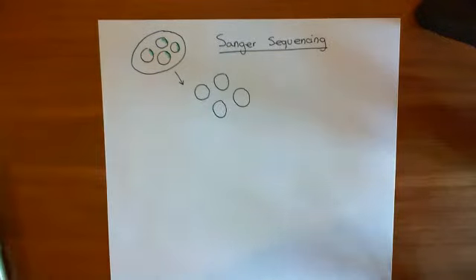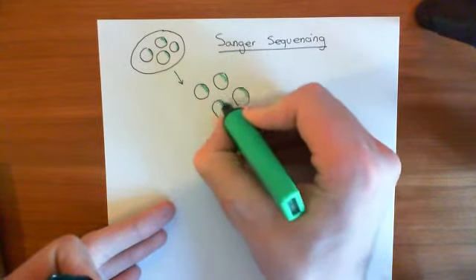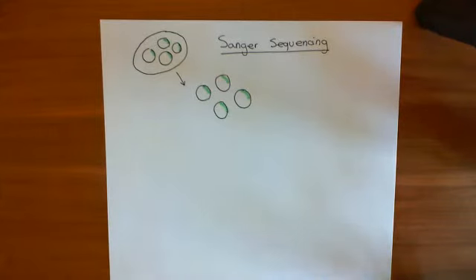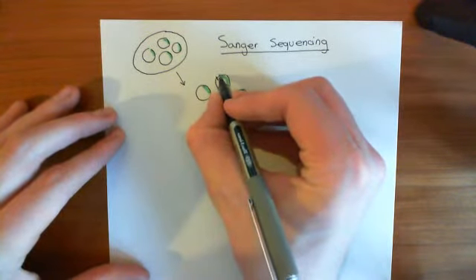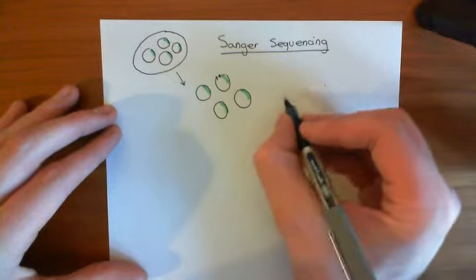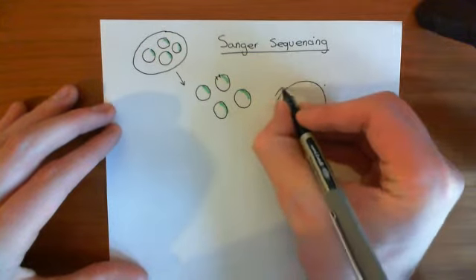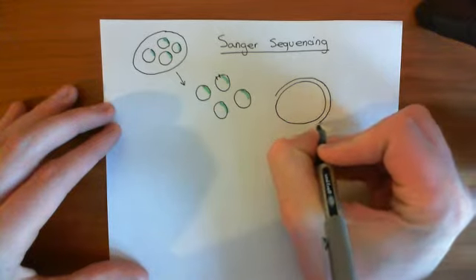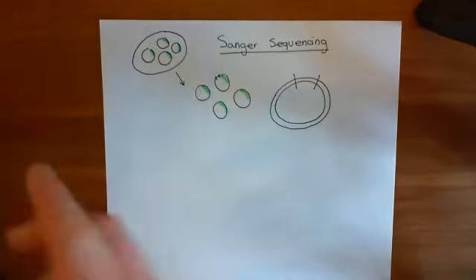Okay, and they all contain this fragment of the genome, basically, one of these fragments that came from the restriction digest. Now, we have set up this plasmid. When we put the fragment inside the plasmid, we didn't just pick any old plasmid. We picked a plasmid with a certain region here to which we can design a nice primer. So basically, if I draw a bigger picture of this plasmid. So I'm going to draw it with double-stranded DNA now. So I'm going to draw both DNA strands. So let's say this is our plasmid. Okay, and this is the second DNA strand to this plasmid. Okay, right. So some region of this is our fragment, our DNA fragment. So let's say here is our DNA fragment in here.